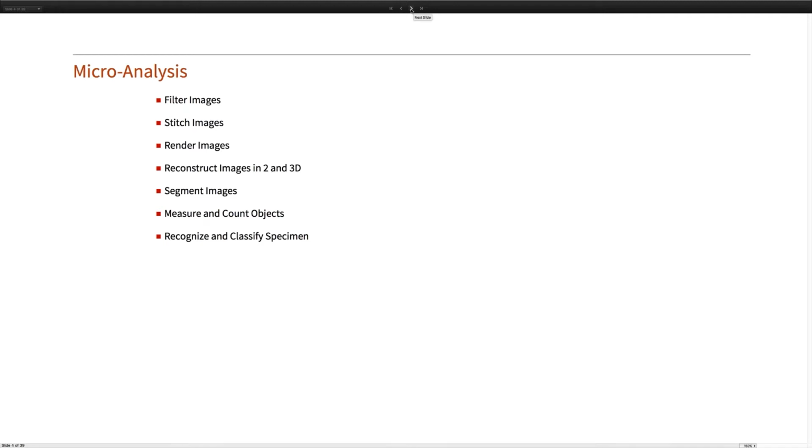That means we take in the images and filter these images. By filtering, I mean basically making sure that the luminosity is correct, that we may even do hyper resolution, that we try to quantify the colors, things like that, to basically make the image look good.